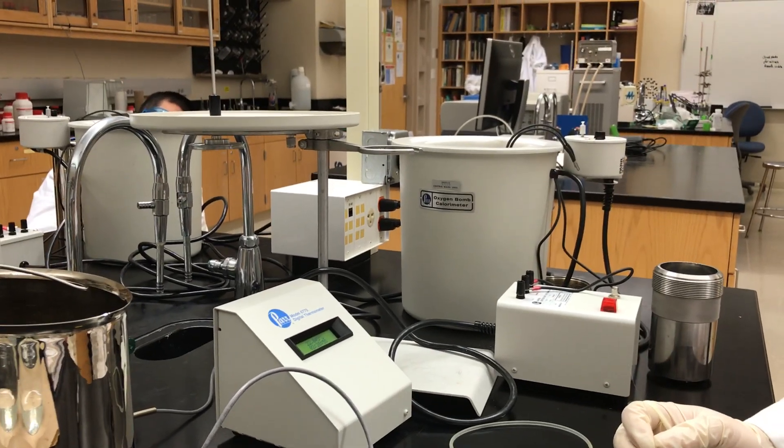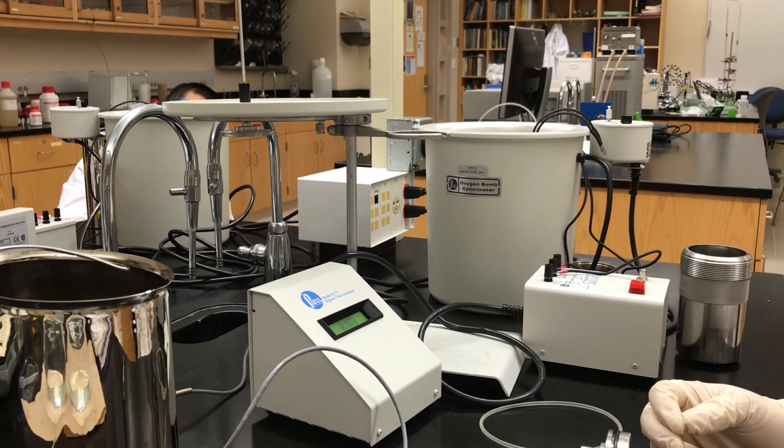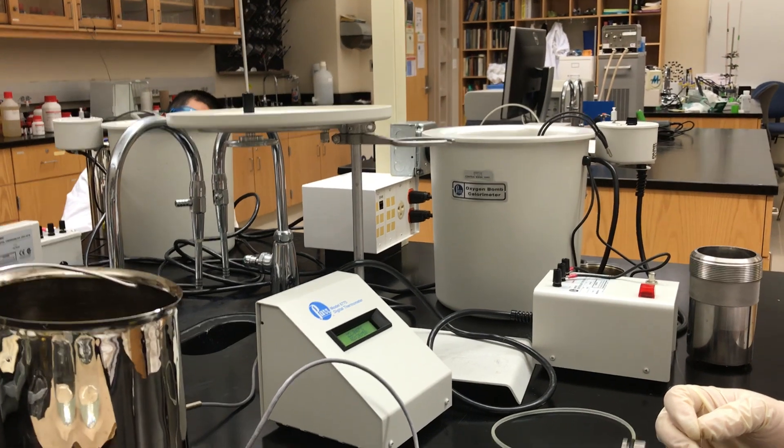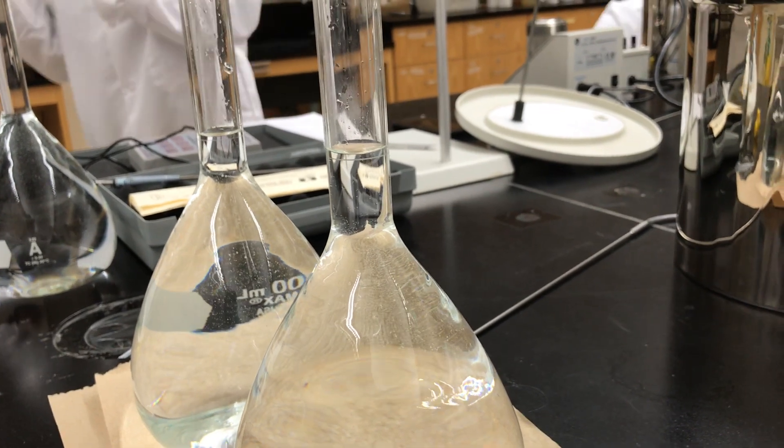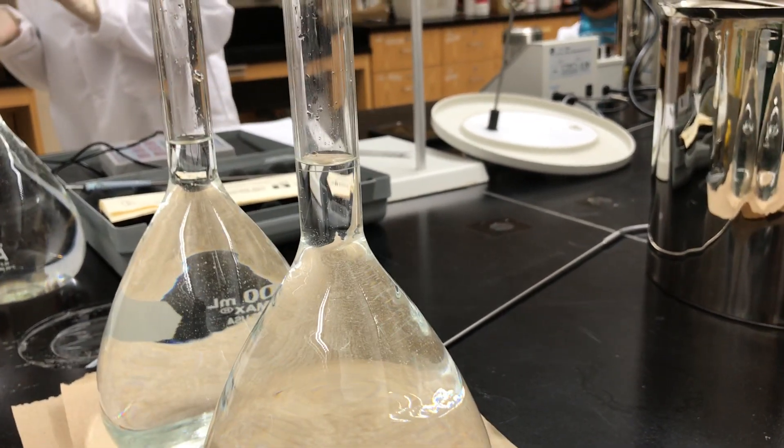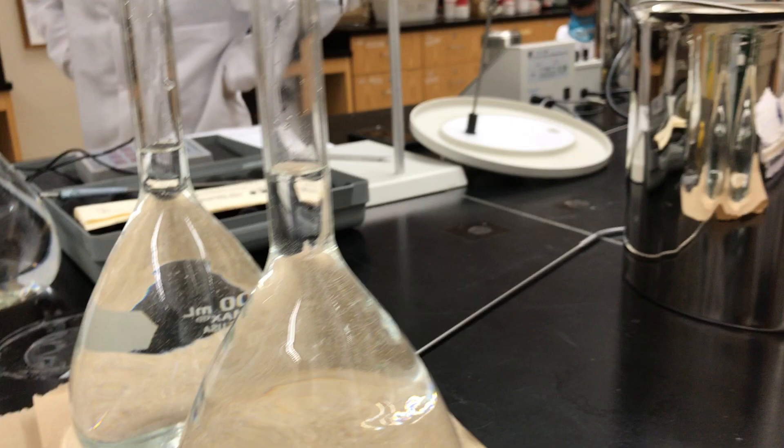This is Central Washington University and we are doing a demonstration on a bomb calorimeter experiment. First step: let the basin water reach equilibrium with the outside temperature within three degrees Kelvin.